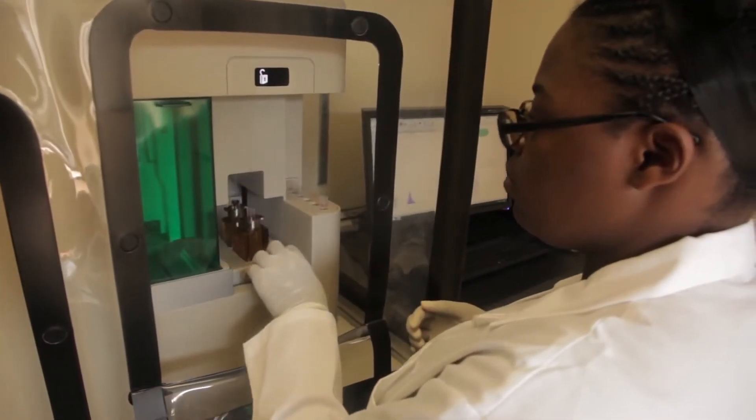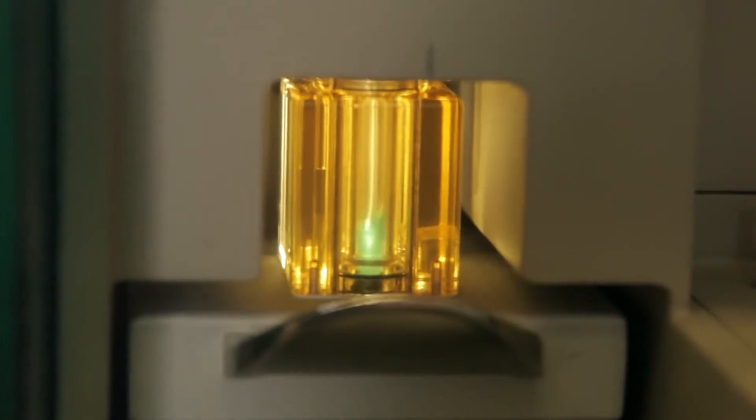You turn it on, and it sort of runs through its checklist, and then it says, OK, we're all done. We've done all of the tests, and the machine is ready to go. Do your experiment.